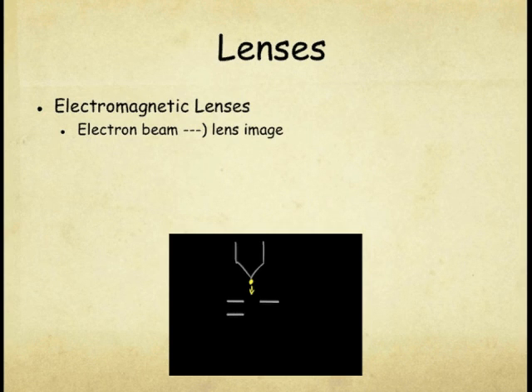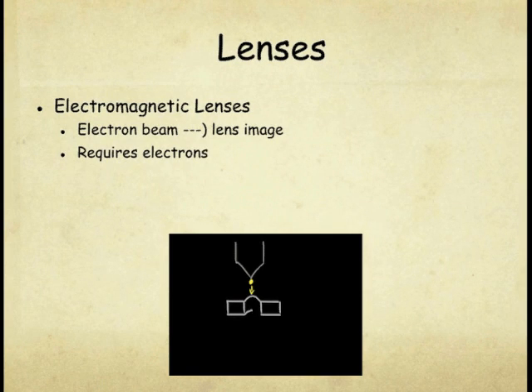Now, by image, we don't mean what you see on the screen. We simply mean the electron beam as it appears on the other side of the lens.